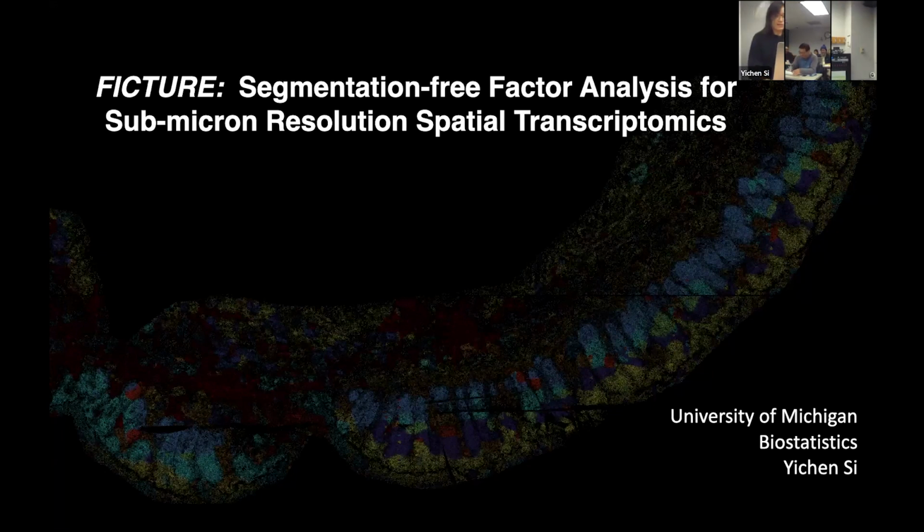Yeah, I recently graduated from Biostat in Michigan. So today I'm going to talk to you about one of my PhD works on a segmentation-free factor analysis tool for sub-micron resolution spatial transcriptomics data.